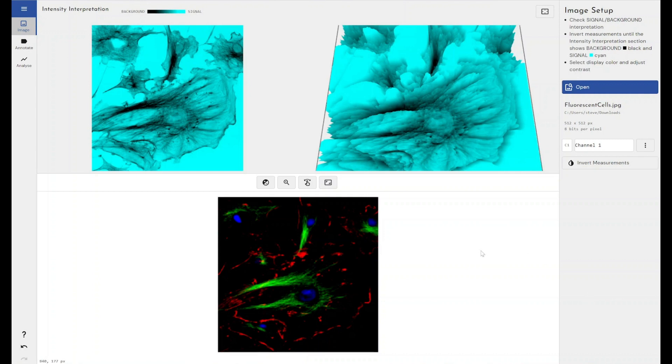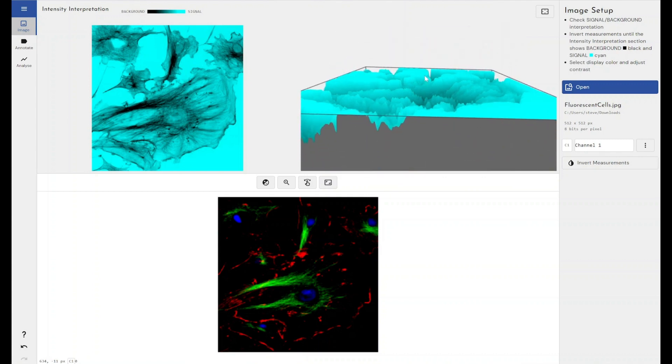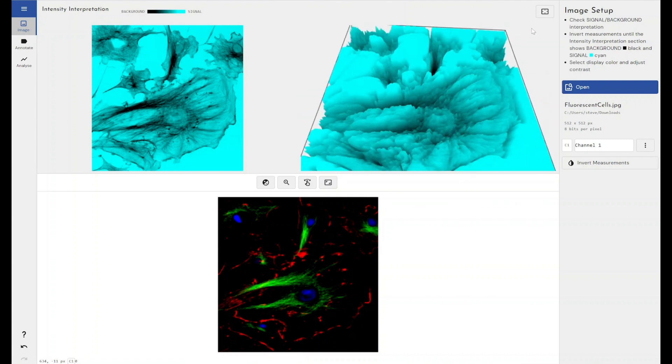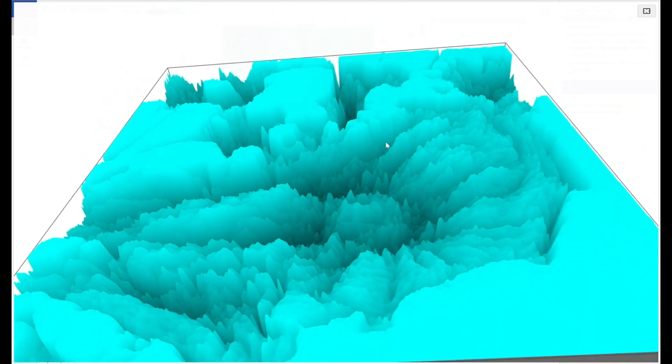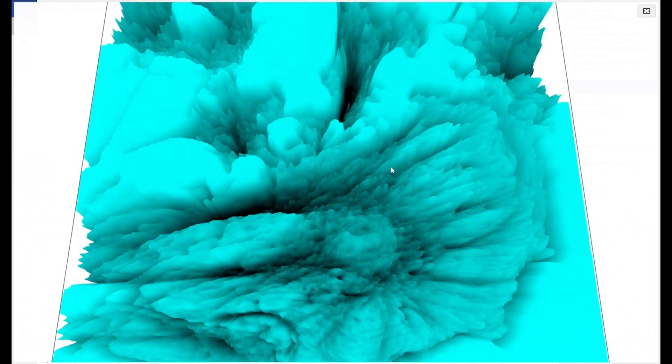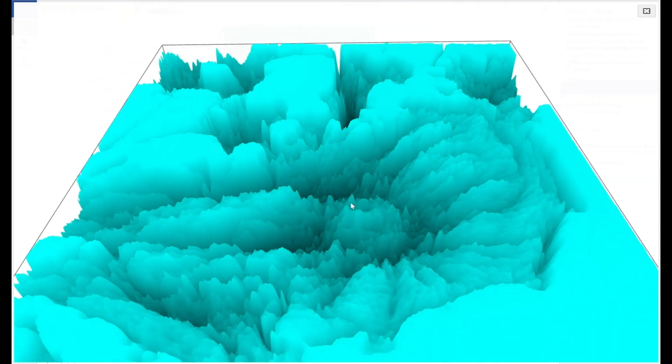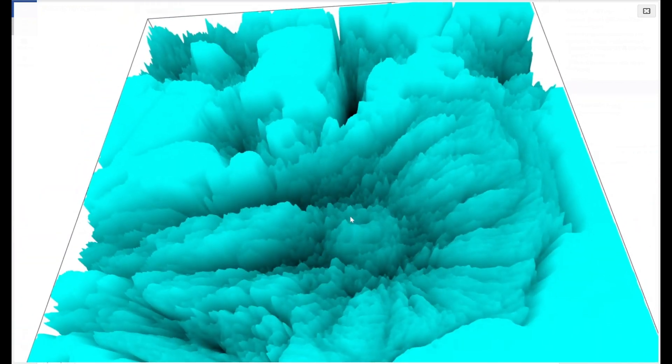I've just grabbed a demo image here off the internet of some stained cells. You can see in the top left here we have a 2D view of the image as it's brought into the software. And as ever we have the 3D view of the image here, a conversion of all the different pixel values within our image converted into these peaks and troughs.